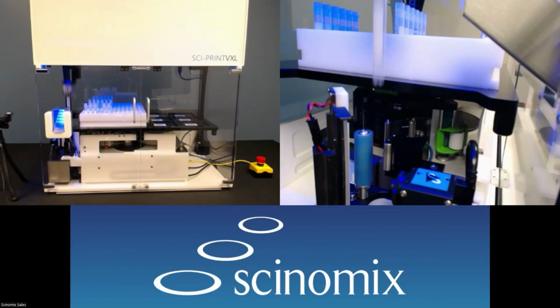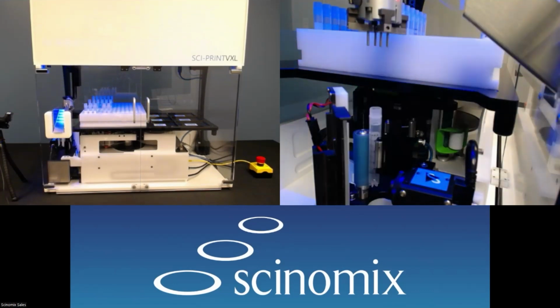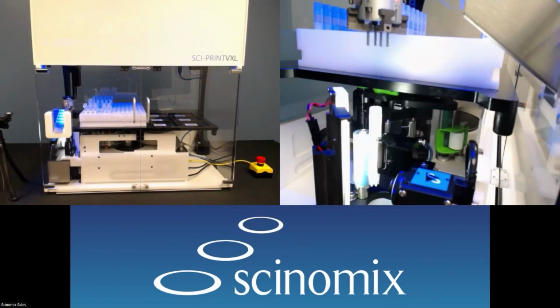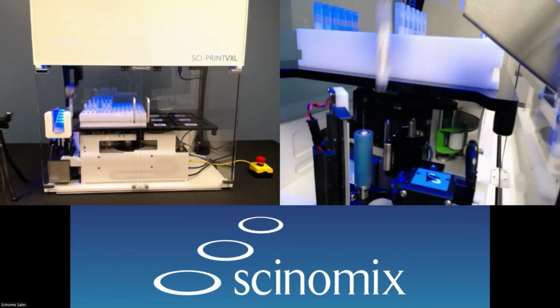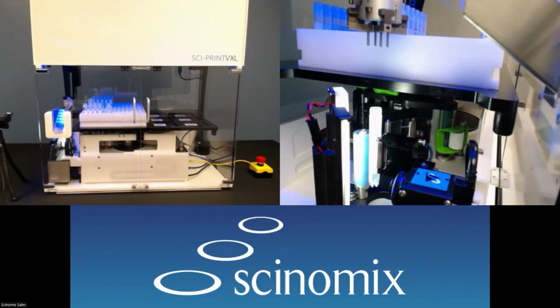So the arm will pick it up and place the tube in the roller. You see the light come on and it spins. So we're doing an alignment and then printing and applying. And then that second turn is the validation, making sure that that new label that we applied can be scanned down the line.